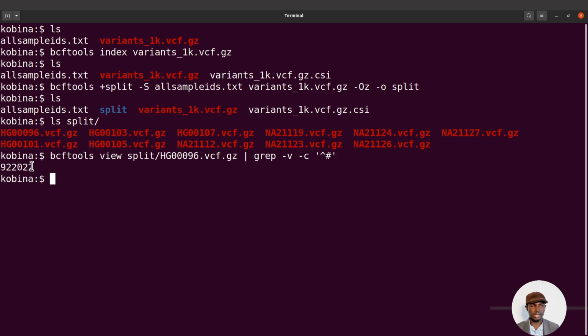So you'll see this number here. We have 922022. Now let's also get the number of variants for another sample. Yeah, this one should be fine. Let me just clean it so that we can do it fast here. So let's record the command. Let's specify this sample, this one here. You can try with another sample too. Then we bring our grep. I'll just copy and paste this one there to be fast, and then I'll execute this command.